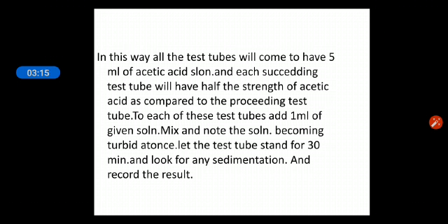becoming turbid at once. Now let the test tubes stand for 30 minutes and look for any sedimentation in all the test tubes and record the result.